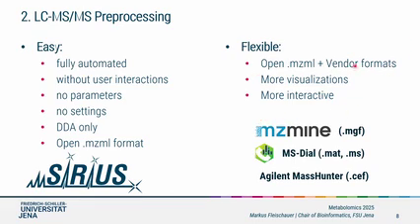The good thing here is they support vendor formats. You get more visualization and it's more interactive, but it also means you have to interact with it, and you have to set parameters and know a bit more about the preprocessing. So in general, both is fine.